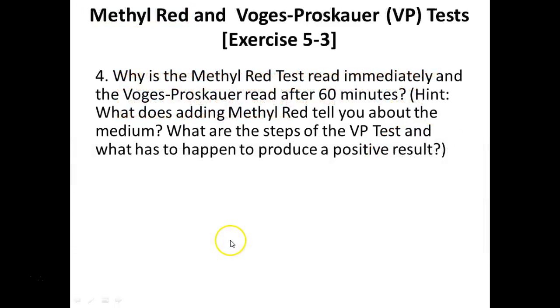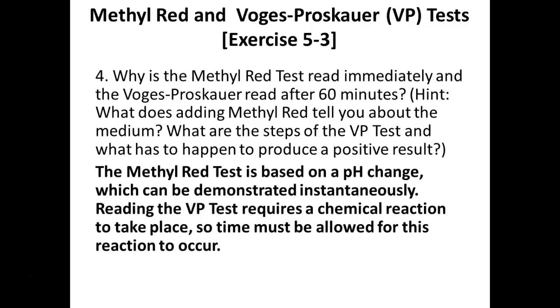So why can we read the methyl red immediately? It's just a what? Just a pH test. Why do we have to wait for the Voges-Proskauer? What are we waiting for to happen? A chemical reaction to happen, right? This can take time.